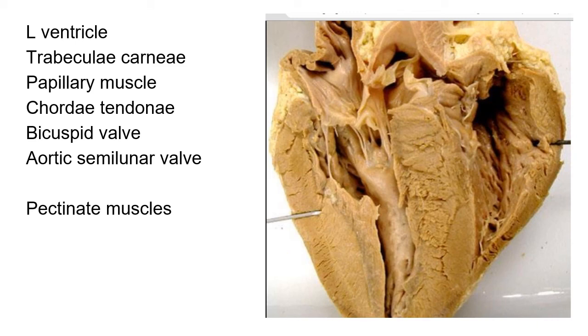So we can see two flaps. So these are the flaps. These two flaps have strings attached to them, and those strings come down and they touch finger-like muscles. You can see them here and here. We can see a big one right here. Okay, so again, we've got flaps, strings, and fingers attached to the strings, and in this case, a huge one. So those fingers attached to the strings, those are still papillary muscles.